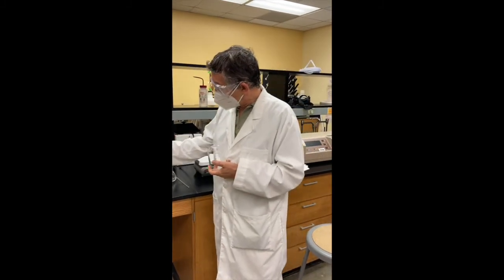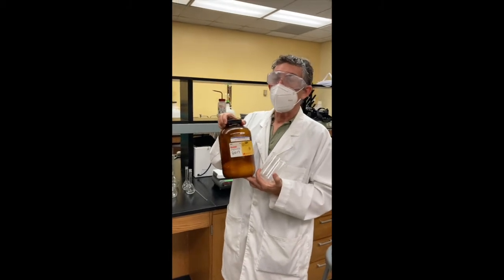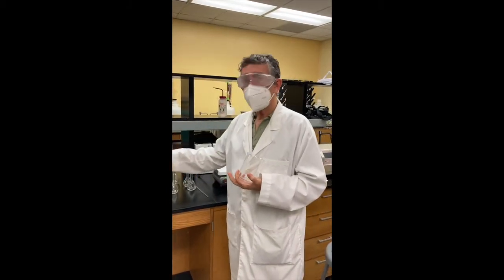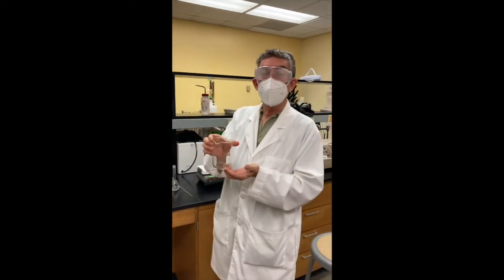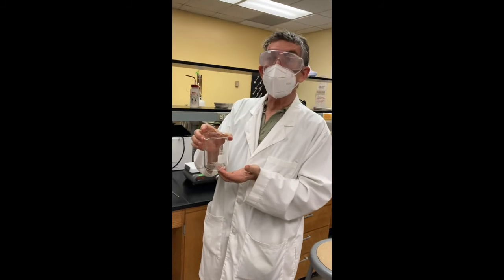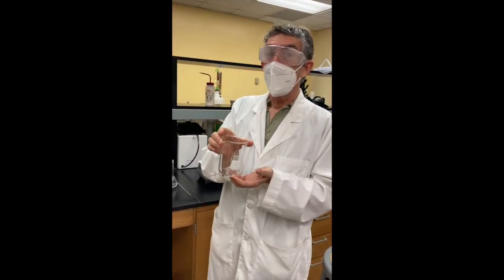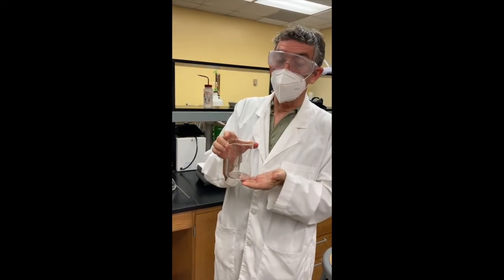We have to make sure we weigh out our sample of polyvinyl alcohol. We have to know exactly how much we have by mass. So in the process, we cannot lose any. We'll put it into water and create the solution. We have to make sure every little bit goes into solution. And when we're done, we can't leave anything behind on a stir bar, for example.